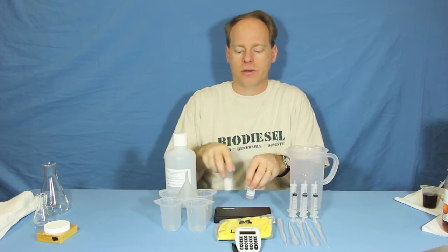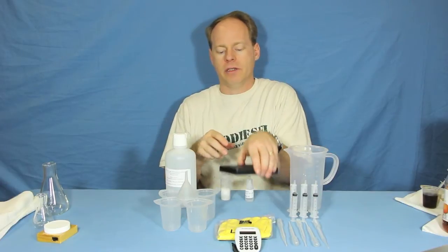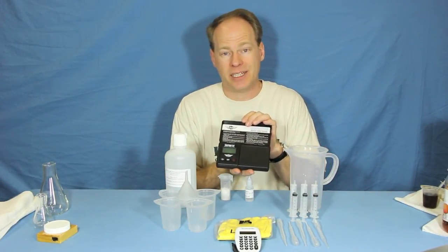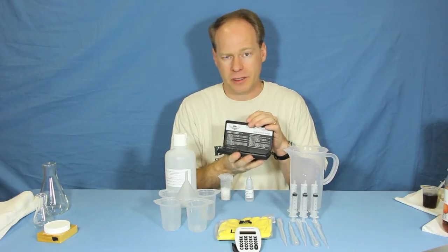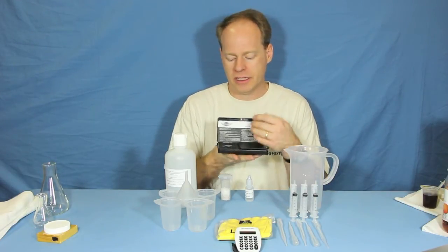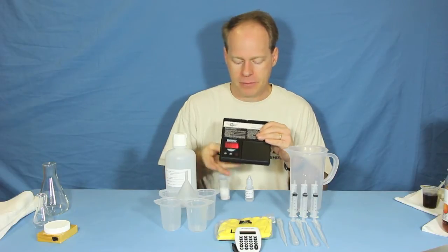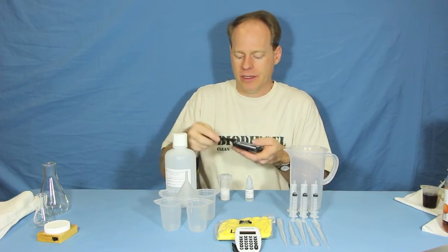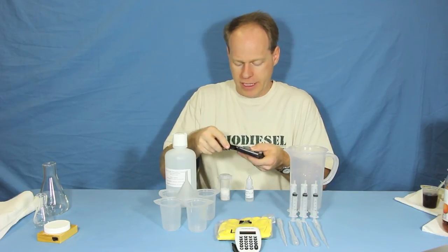The other thing this kit has is the included heavy-duty Triton T2 scale. It's a really nice scale with a 30-year warranty and a backlit display. The tray comes off so you can measure your catalyst into it — just a really nice setup.